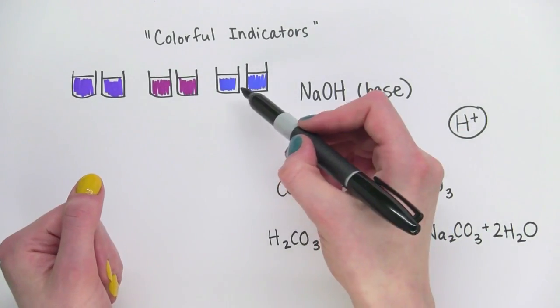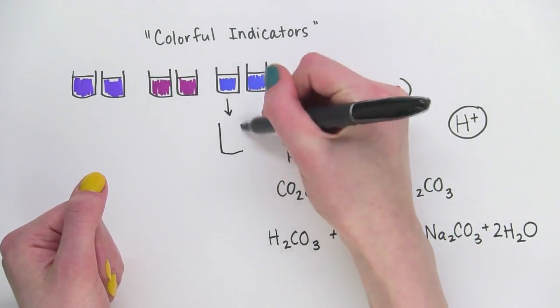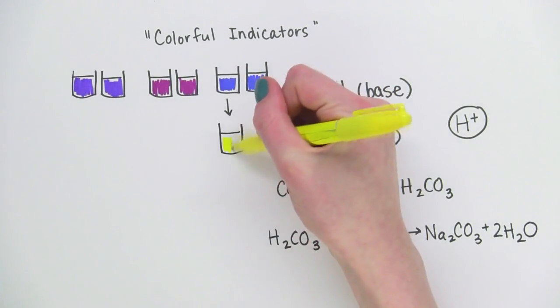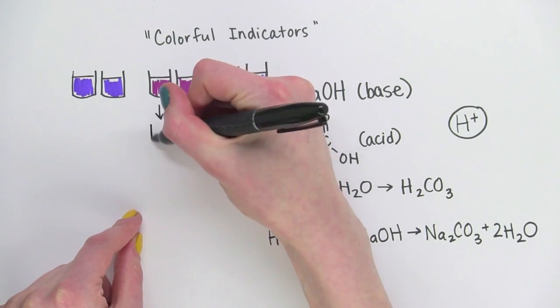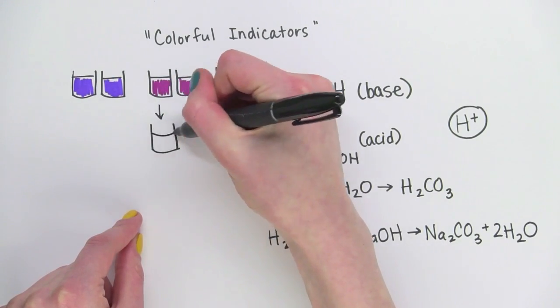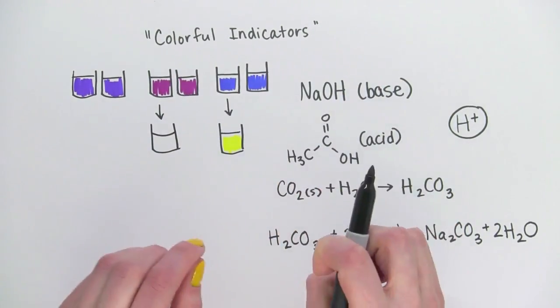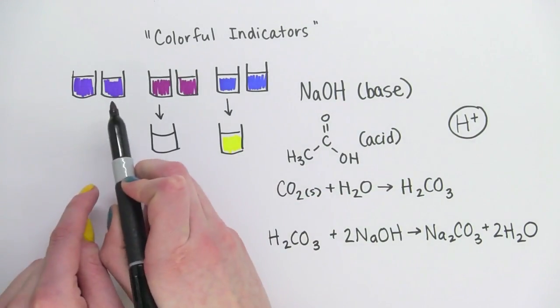So we saw our bromothymol blue turning from blue to yellow as the solution became more acidic. And we saw our phenolphthalein turn from pink to colorless as it became more acidic. Now let's watch again what happens in the final set of cylinders.